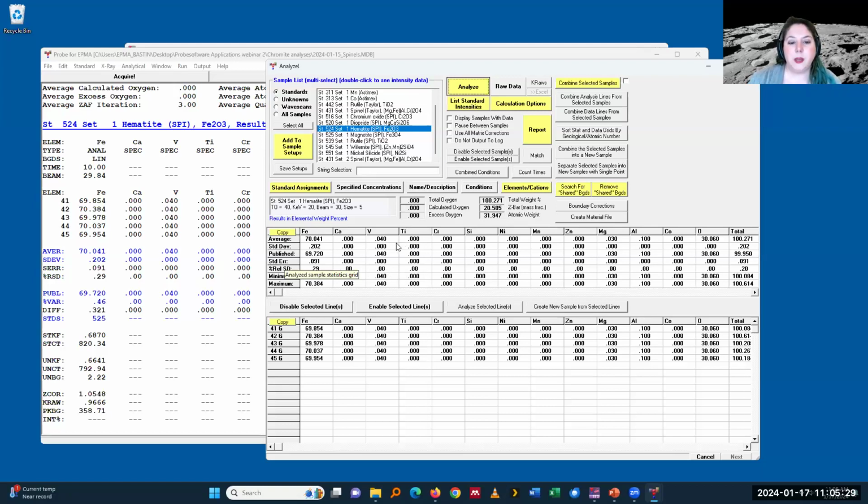And then lastly, if I have a secondary standard that I want to monitor, sometimes I just run them as a primary one, like I run them as a standard. But sometimes you have a different secondary standard or something, and you want to run it like an unknown. And that's what we've done also in this run. So these are Bernie Wood, other spinels that we run at certain times in between. And I also analyzed a chromite standard from my standard collections as a secondary standard.